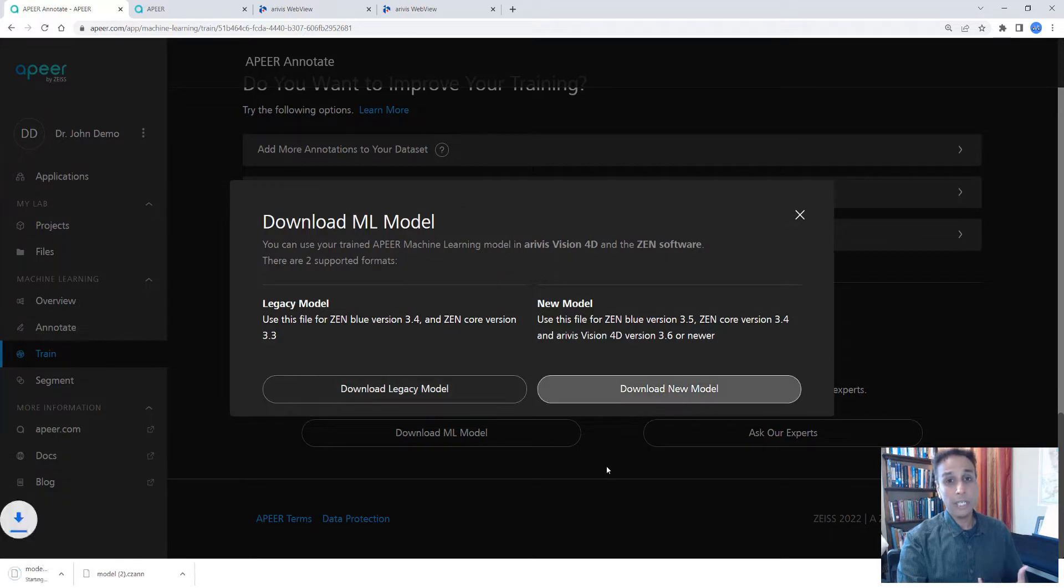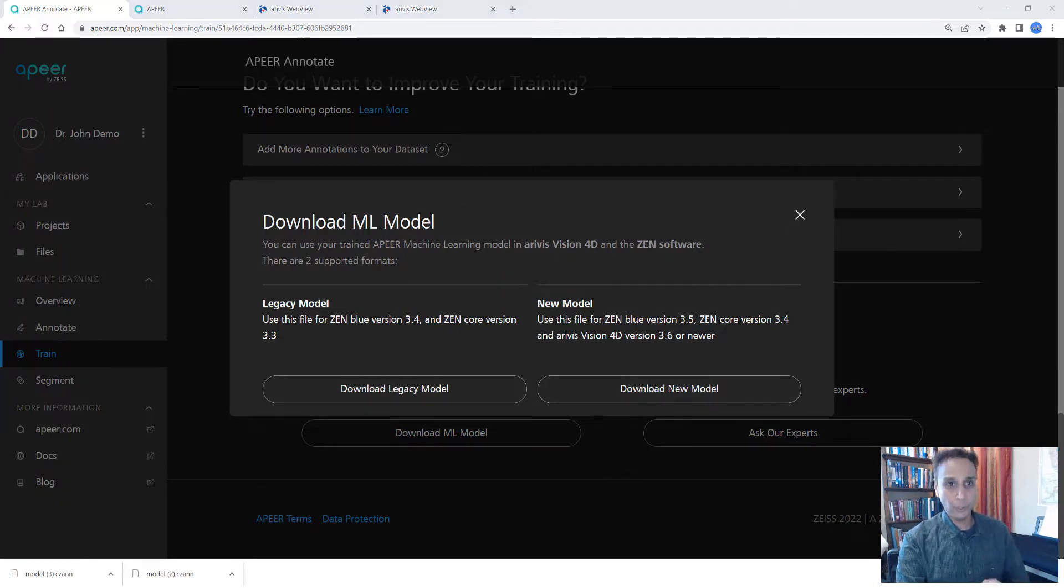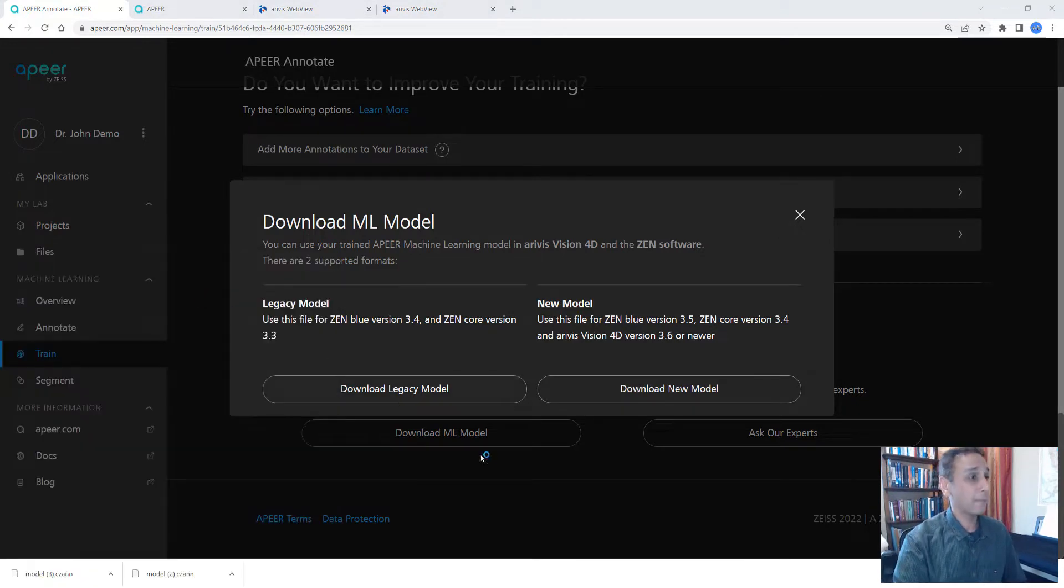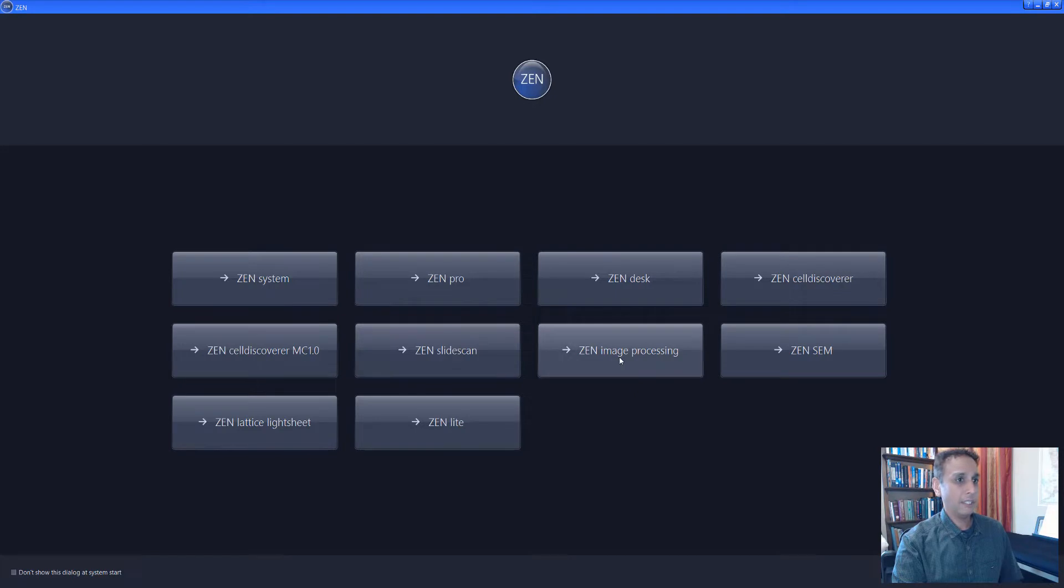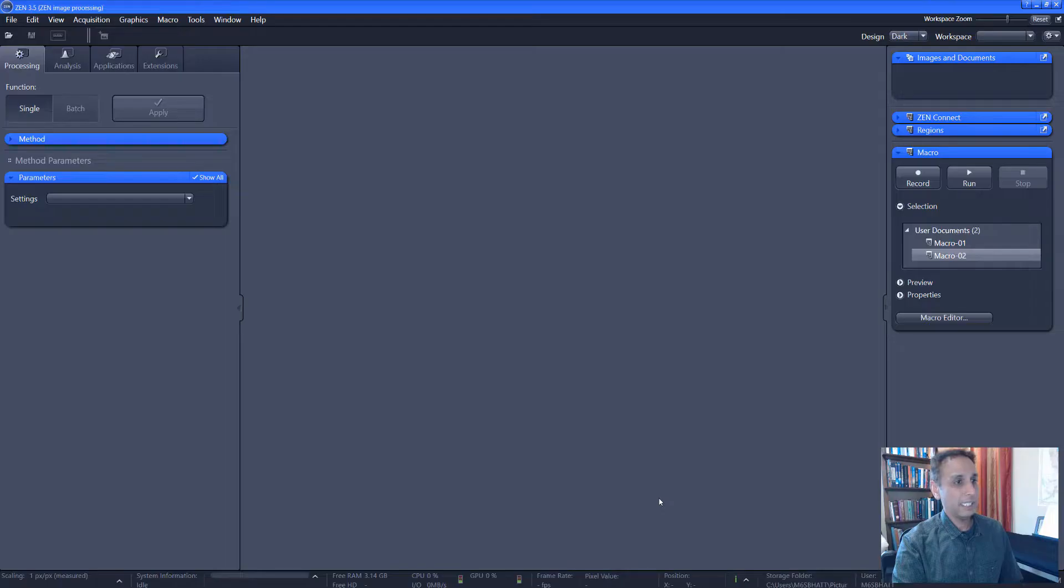The goal is to detect nuclei, glomeruli first, and then within each glomeruli, detect nuclei. That's why we train two different models. So let's open Zen Blue. It should take a second. There you go. Let me open this in image processing mode. And again, there you go.